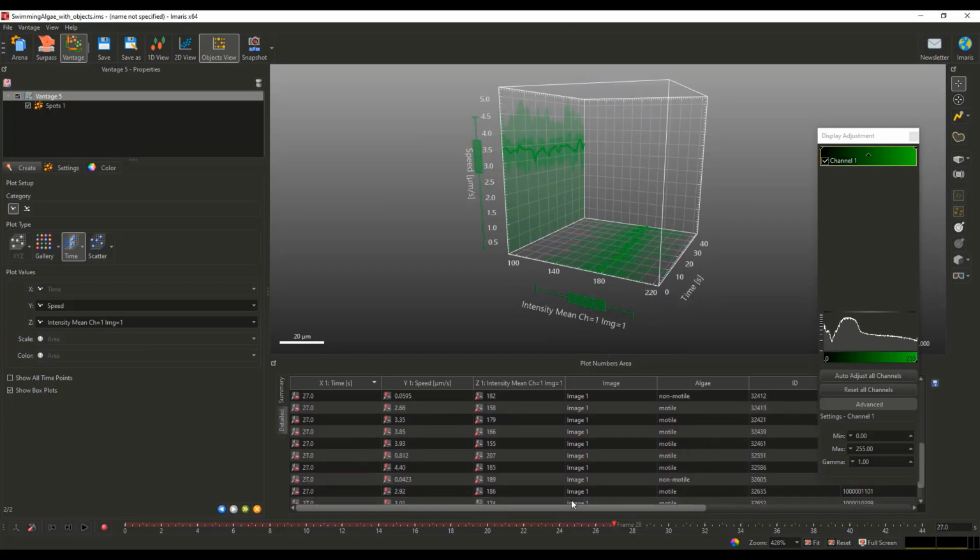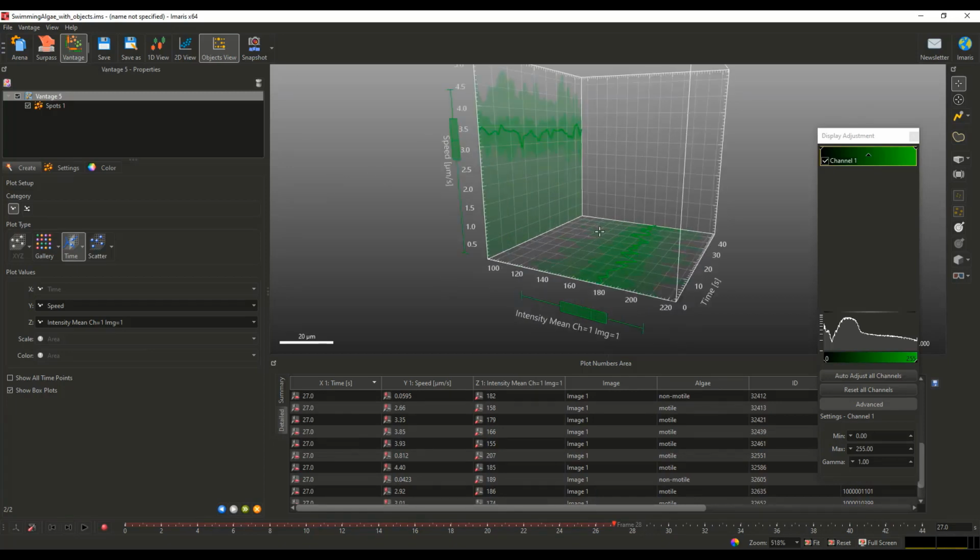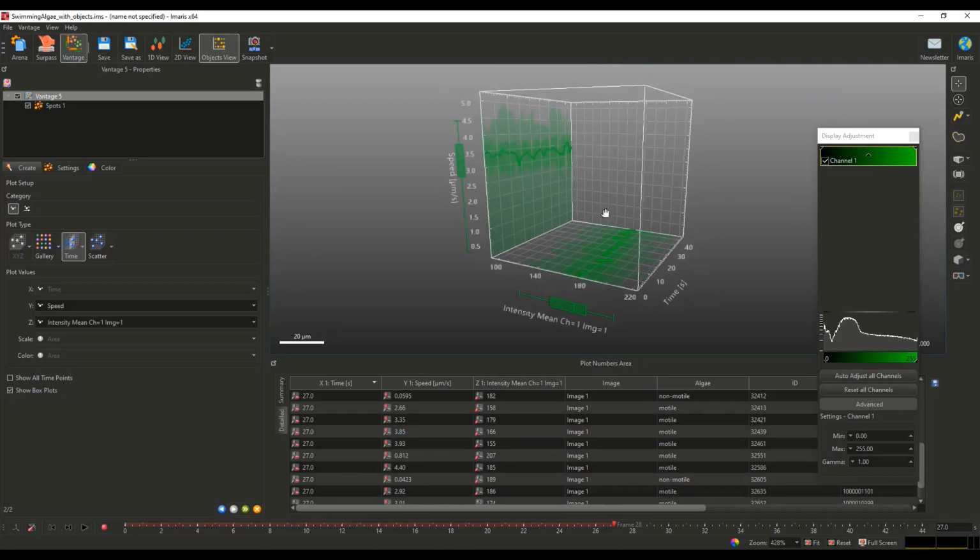Okay. Again, if you have a population of data sets like what I showed you before, you can compare those. You will have two box plots to compare. The results will be again exportable here into Excel. Everything is there which matches the plot you see.